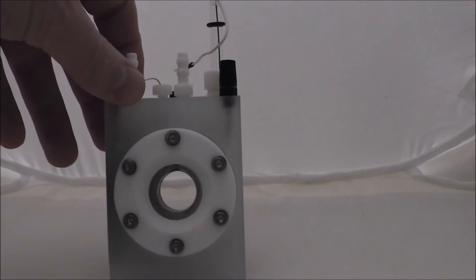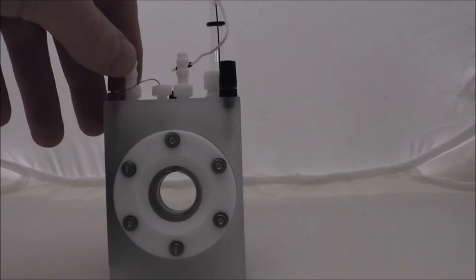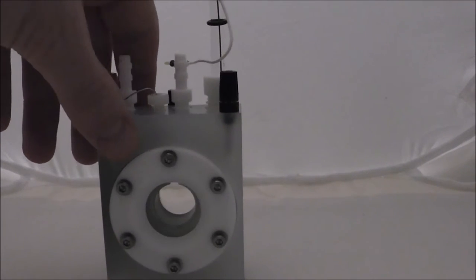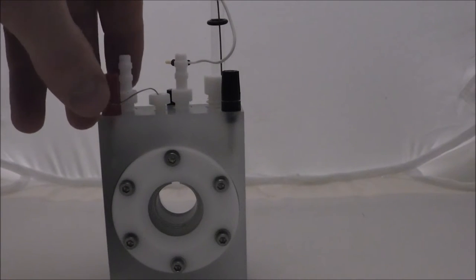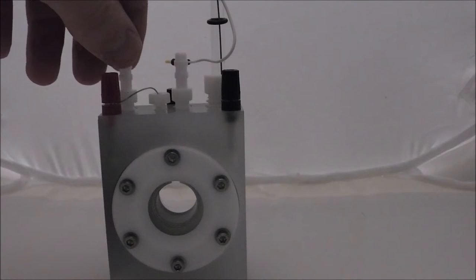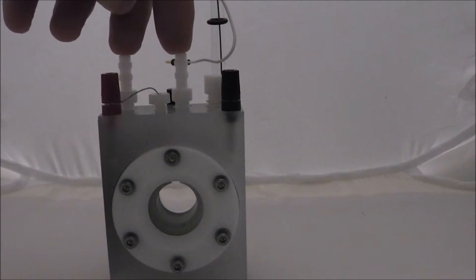The cell has a window which allows the transmission of light through it, with a window on both sides. It has inlets for liquids and the ability to degas the solutions as well.